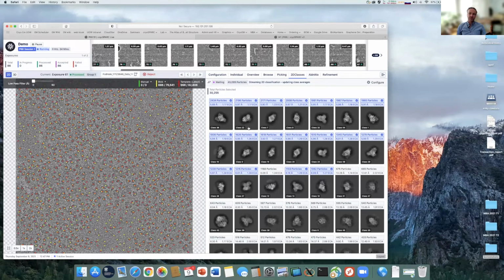Every researcher's got their own favorite tools on how they want to validate their structures, because there's limitations on how much data you can collect, how much time you want to spend working on your structures, and how many different subgroups you want to separate your protocols into. It gets to that question of how long is a piece of string when it comes to refinement.